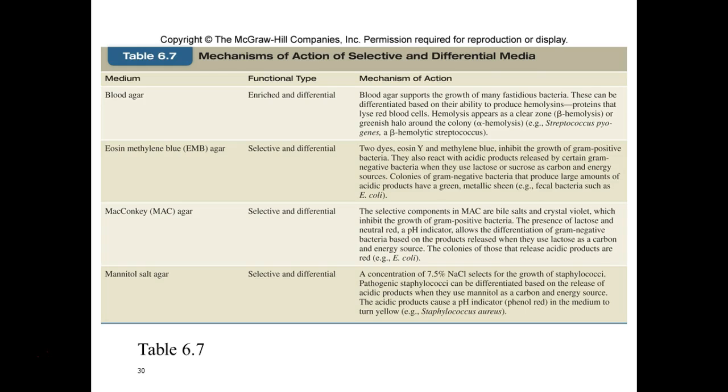And there's a particular group of bacteria we're typically looking for when we use this media. We're looking for staphylococci, because staphylococci tend to be salt-tolerant. So they'll grow in the presence of this very high salt. And then one particular species, Staphylococcus aureus, which tends to be pathogenic, disease-causing, right, can ferment mannitol.